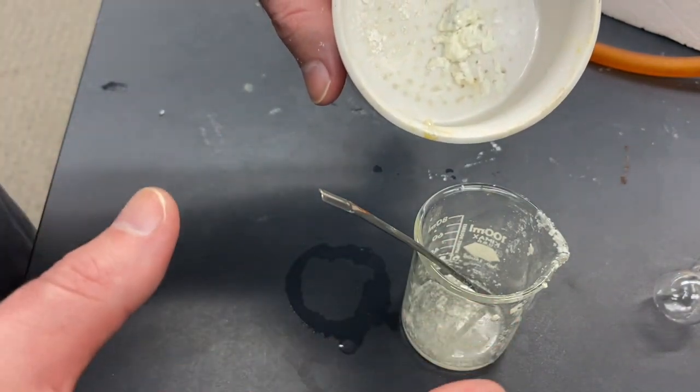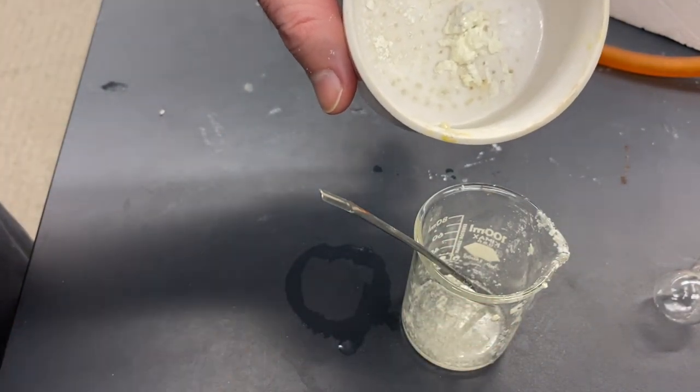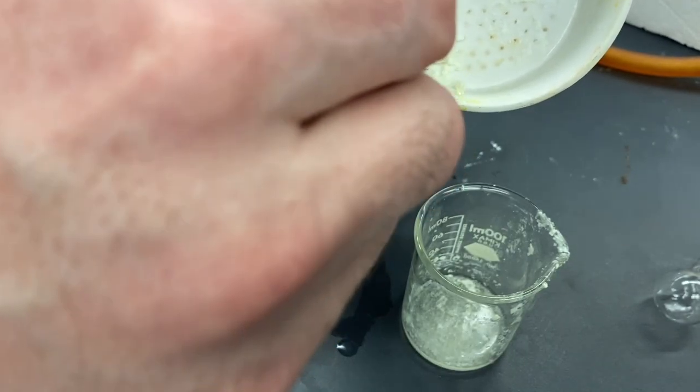And that's the main step that we wanted to do — remove pretty much all of the water that we could. Now we need to recrystallize this. The process for doing that is to take 95% ethanol and just barely get this to dissolve in it.